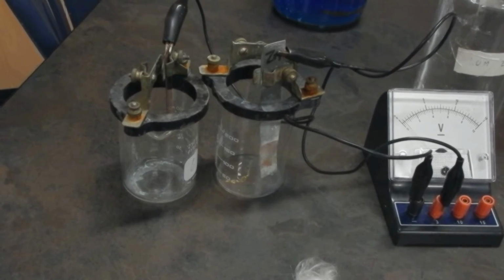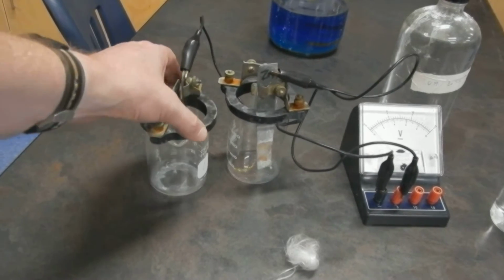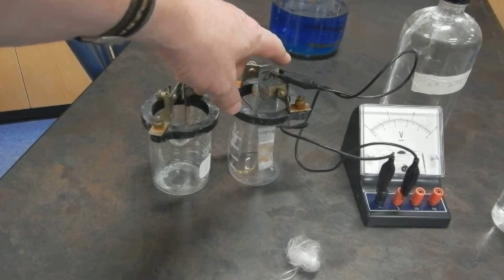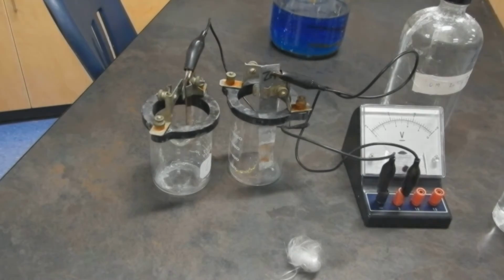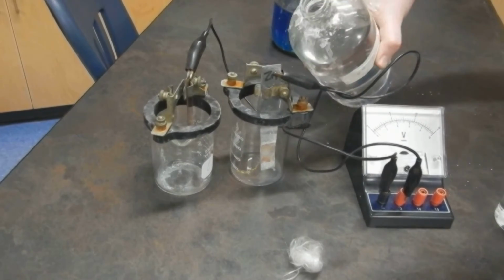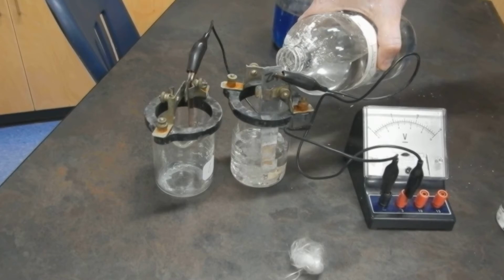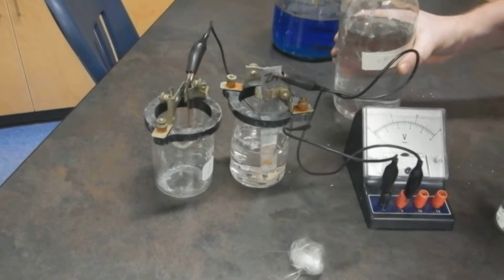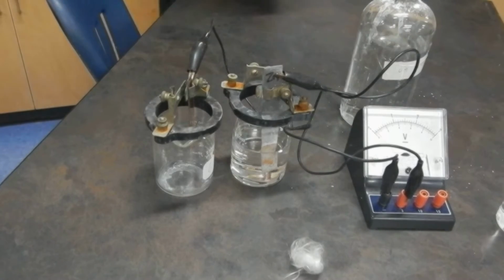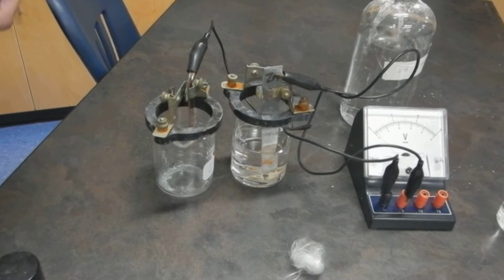Good day. We're going to try to make an electrochemical cell. Here I have a copper electrode, and here I have a zinc electrode, and so I've got to add solutions. So I'm going to add some zinc sulfate here. And this, the copper half cell, I'm going to add some copper 2 sulfate.